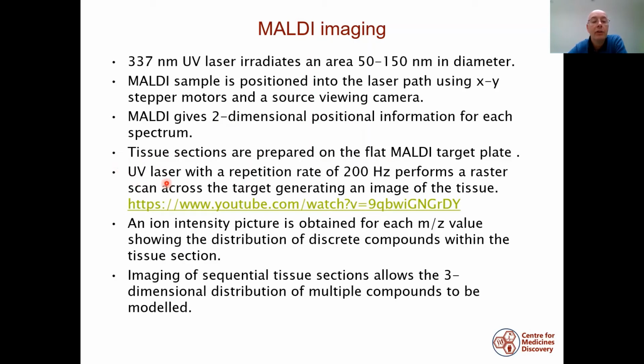Then you use your laser, a very high repetition rate laser. Instruments are specifically designed for this, with a 200 hertz laser, so it's firing extremely fast, and it can perform a raster scan across the target plate. This will generate an image of the tissue, and I will try and show you that.